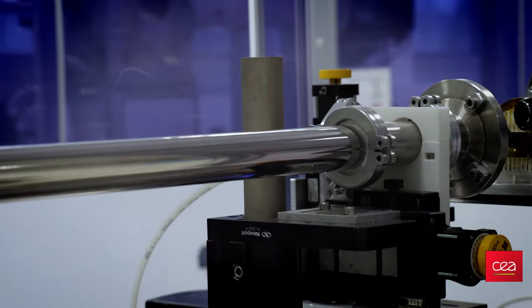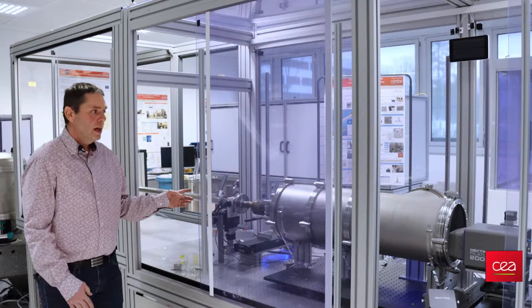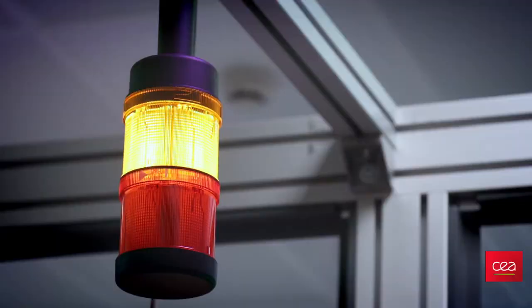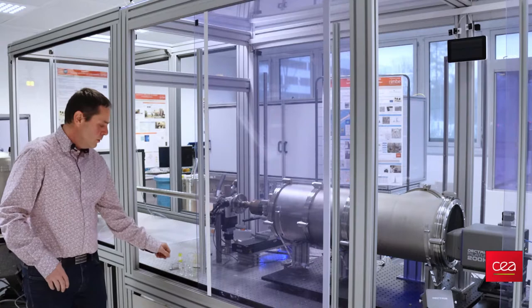The concept of this instrument is to have a fixed beam size and a fixed distance between the sample and the detector. The configuration is never changed. This reduces the time spent on different settings. The idea is simple: to put the sample on the beam and to start the analysis.